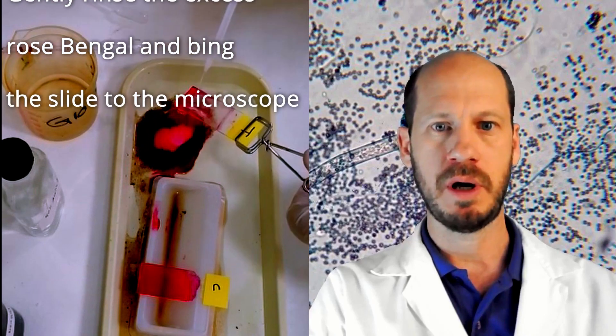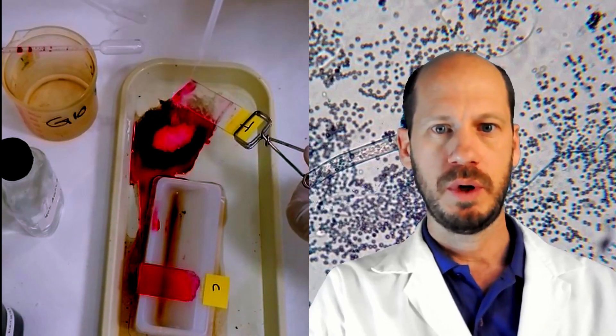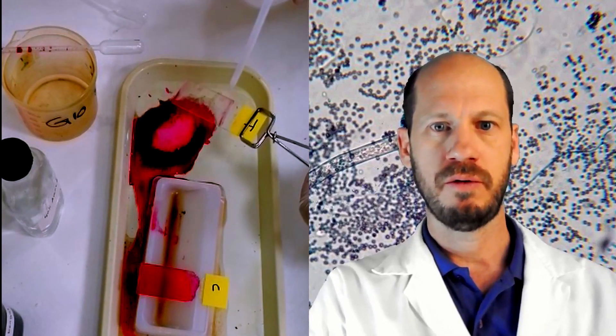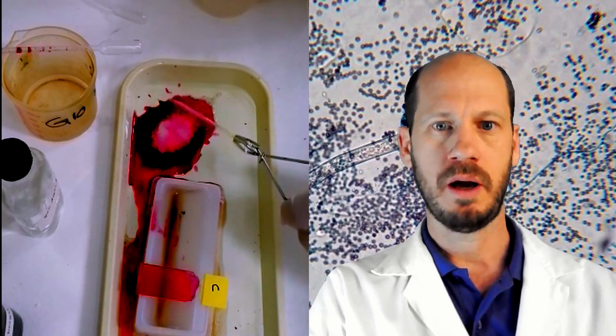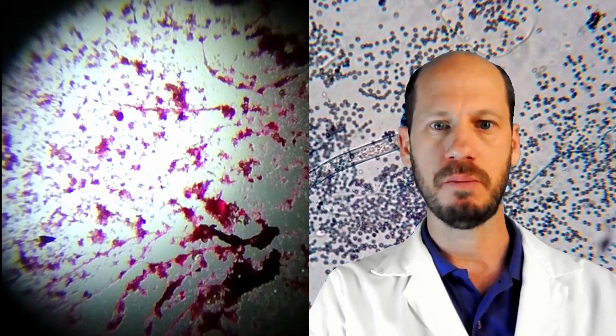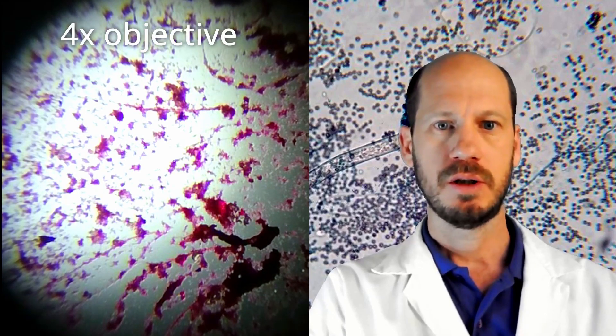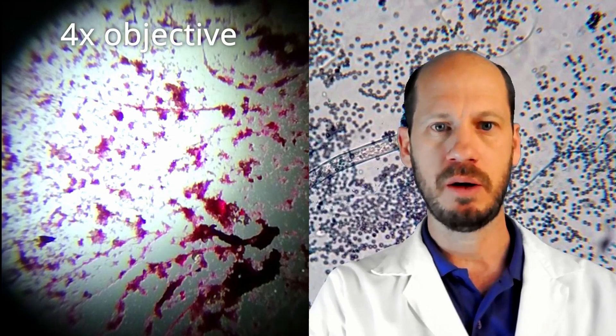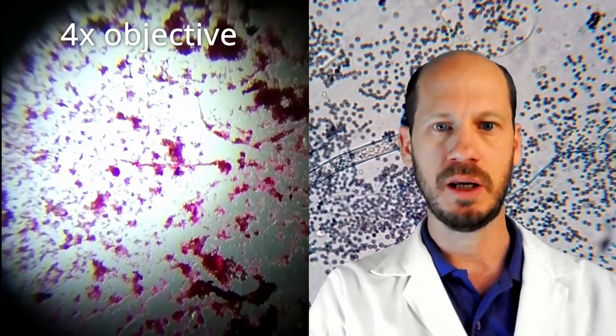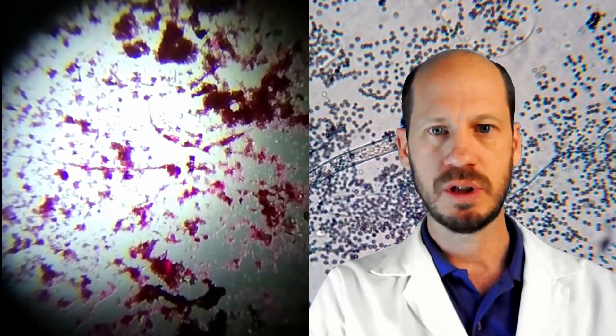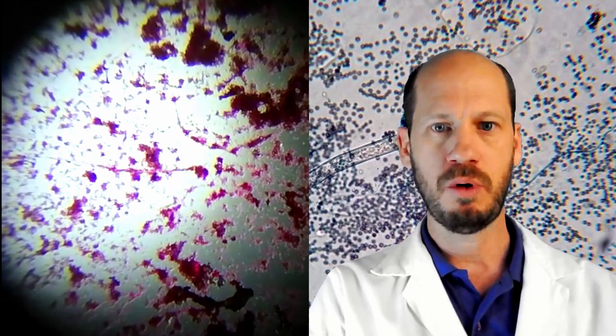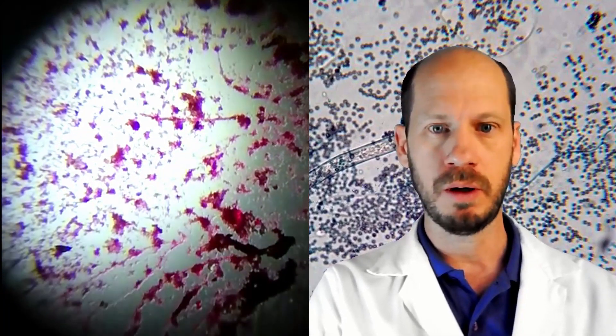Before observing in the microscope, we need to remove the excess of the rose bengal again. It looks like there is not much there, but when you look in the microscope, you will see very cool images. Here is the image on the microscope with the four times objective. At first, you don't see much. You see some soil particles and some aggregations that could be colonies.